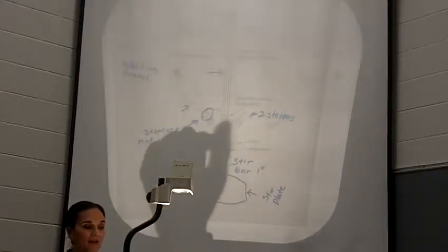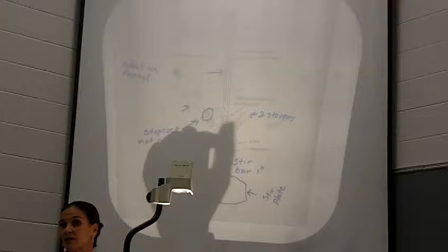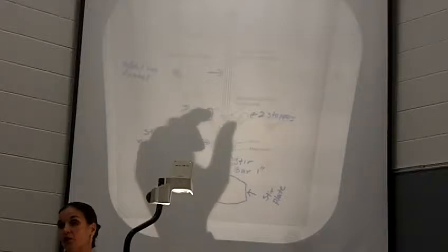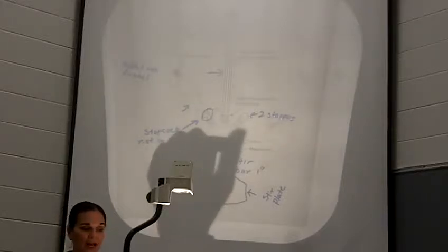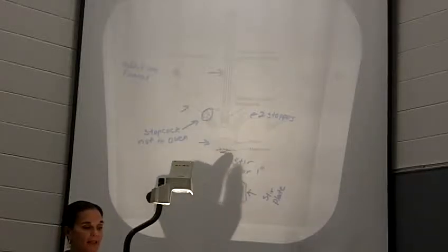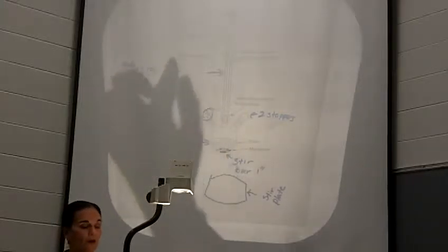Then you're going to add 10 milliliters of ether to this. This is going to be dry ether, okay? So not in the red can. In the reagent hoods are bottles of ether that are dry, or anhydrous. That is what you're going to use for this reaction, okay? So you have your magnesium, 10 mils of ether in here.